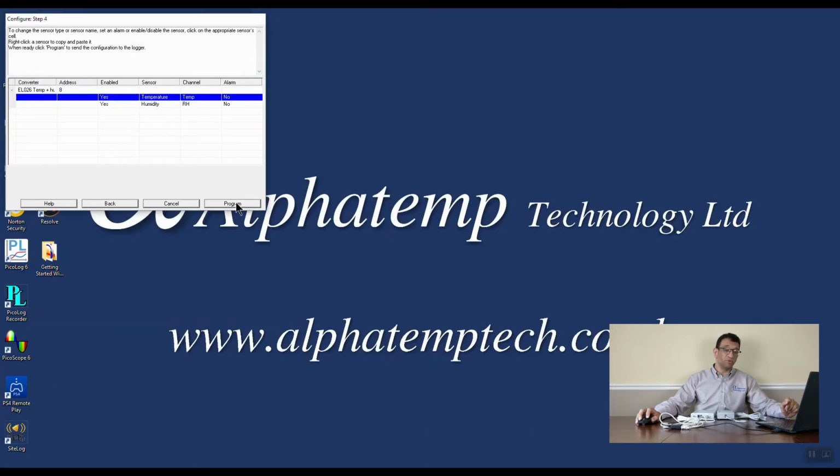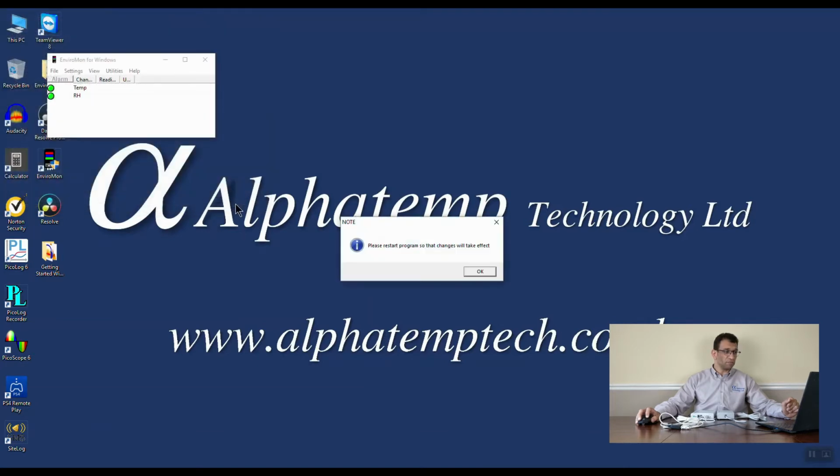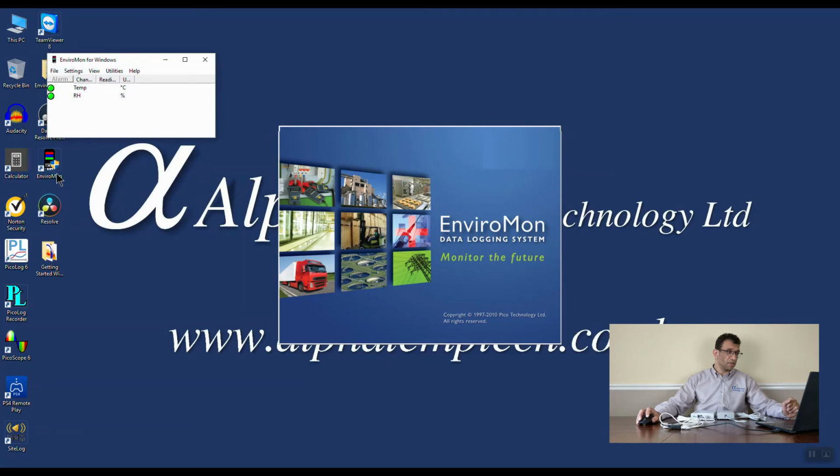And now what we can do is program. What happens here is it will write the configuration we've just made, and it will be programmed into the data logger. Once that's complete, we can click on the Finish button, and it will ask us to restart the program for changes to take effect. And then we can restart the program. And you see some live readings over there.